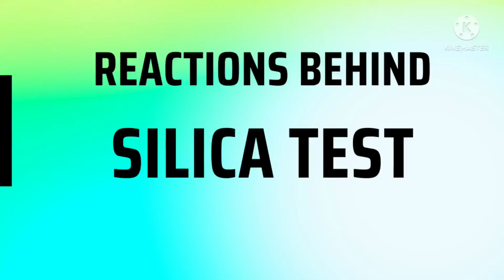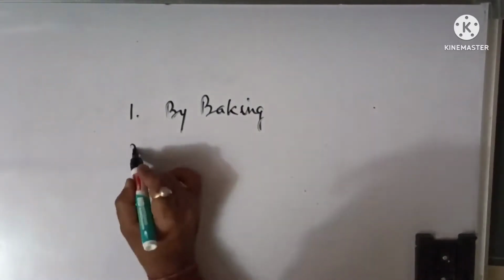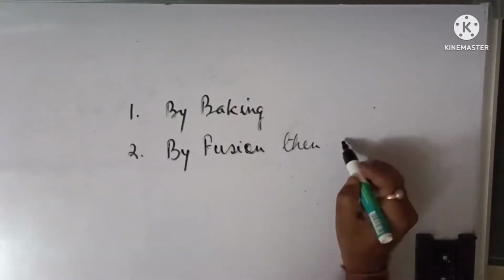Hello friends, welcome back. Today I am going to elaborate the reactions behind the silica test. We know that while doing any full analysis, we follow two ways: by baking, and by fusion and then baking.